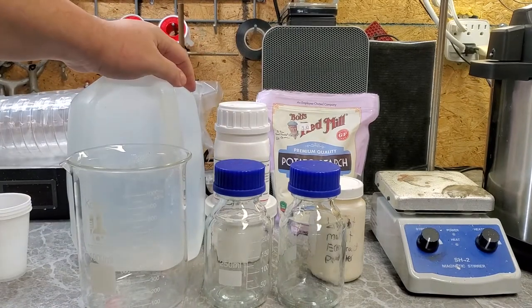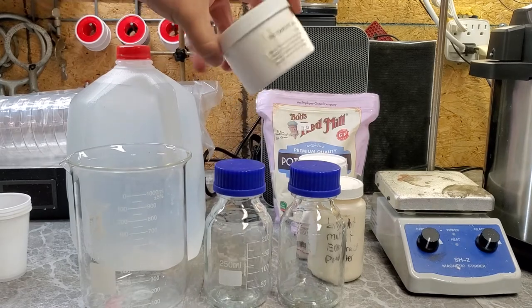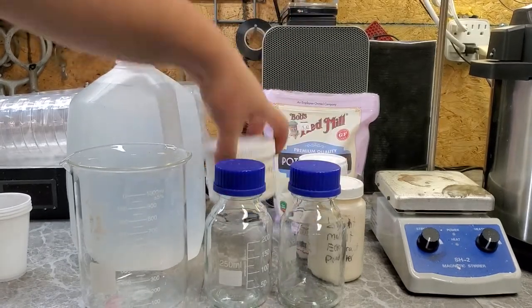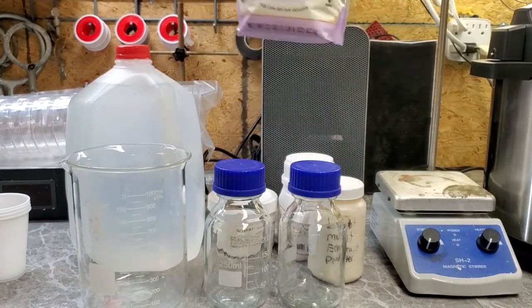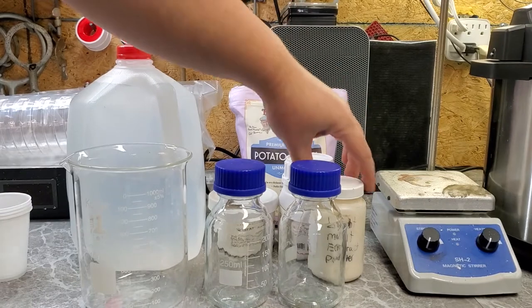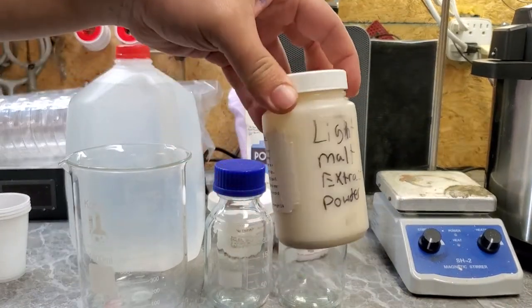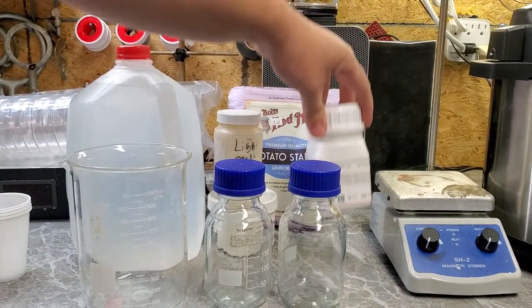The grow medium that I'm going to be putting into those petri dishes will be agar-based. I have some nutrient agar, some potato starch to add to the agar for the mushrooms since they need more nutrients than nutrient agar alone. Also light malt extract powder and yeast extract powder.